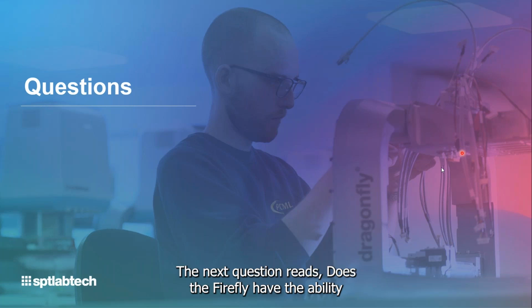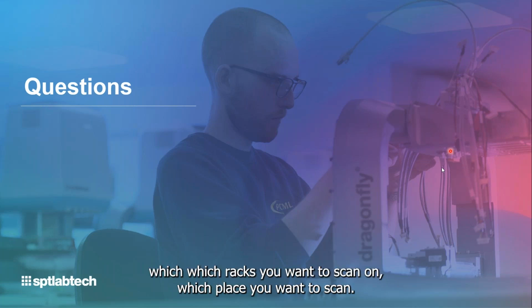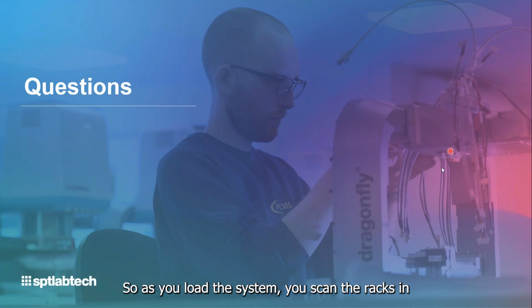The next question reads, does the Firefly have the ability to scan barcodes? I'll take that one. Yes. So initially, we will be offering a handheld scanner, and within the software, there's an option to select which racks or plates you want to scan. So as you load the system, you scan the racks in.